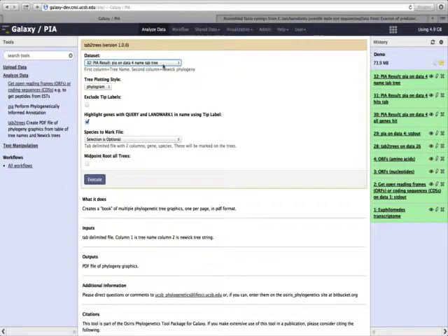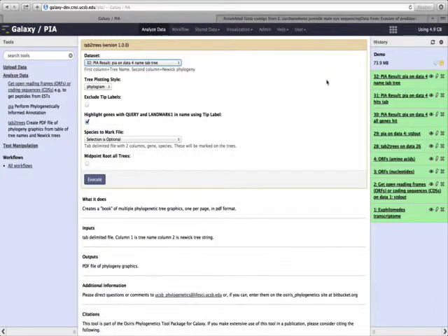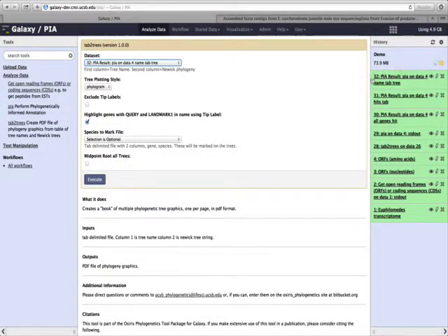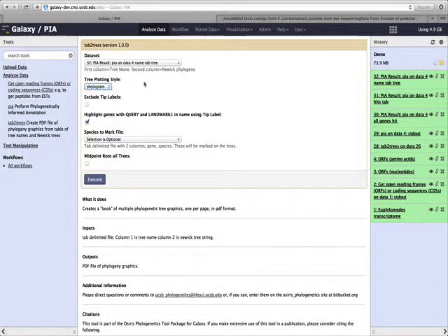This has different options. First, we need to tell it which dataset to input. This is the correct dataset here, number 32, which is our PIA result. We can choose which style of tree we want, and a phylogenetic tree is good here.